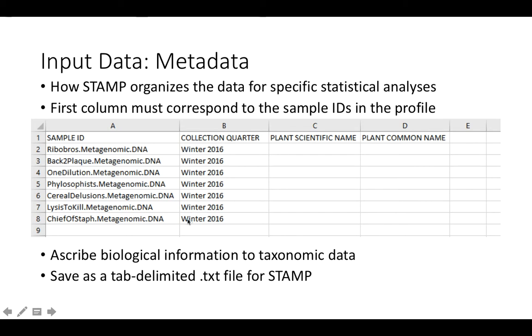Notice how all of these samples here belong to Winter 2016 in the category 'collection quarter.' The metadata file is how you will ascribe biological information to your taxonomic data. So you can organize your samples according to the pH from which they came from, or how much moisture was in that plot or sample. Just realize that for STAMP, describing categories such as high, medium, or low, or 1 to 5, 6 to 10, may be more helpful than giving discrete numbers for this metadata file. Once you are ready, you can save this as a tab-delimited text file for STAMP.